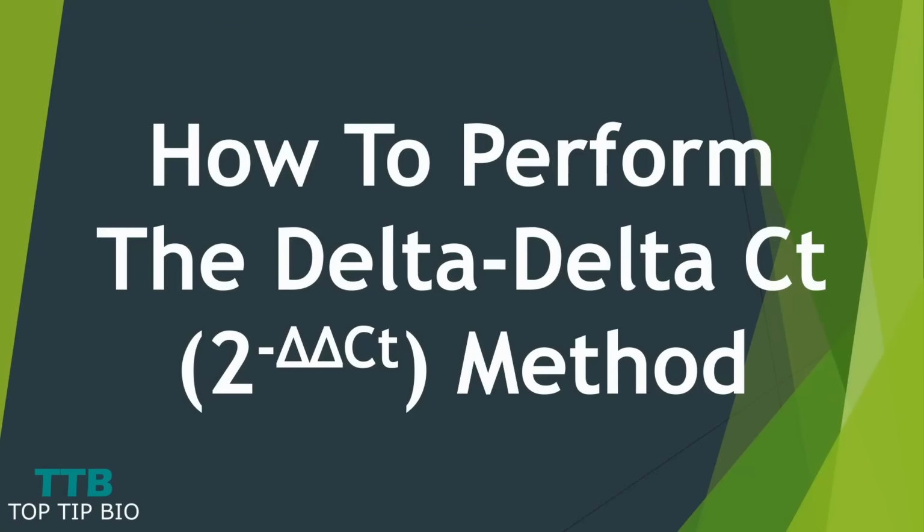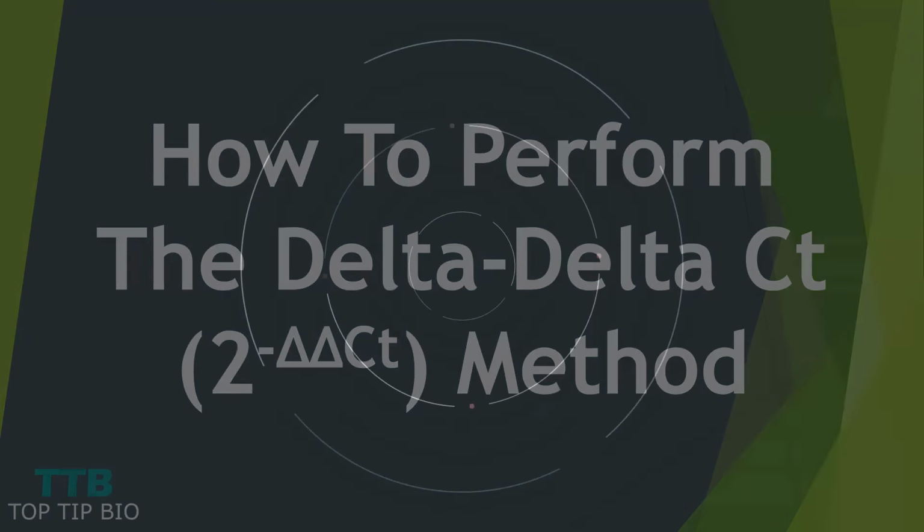In this video, I'm going to show you how to perform the delta-delta CT method for calculating gene expression values from a real-time PCR experiment by using Microsoft Excel.